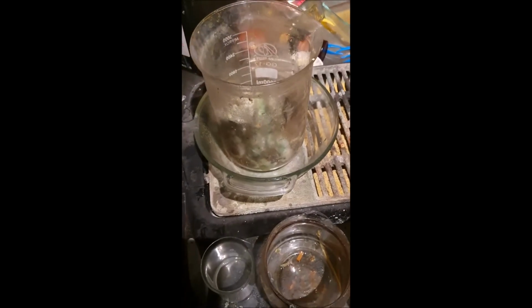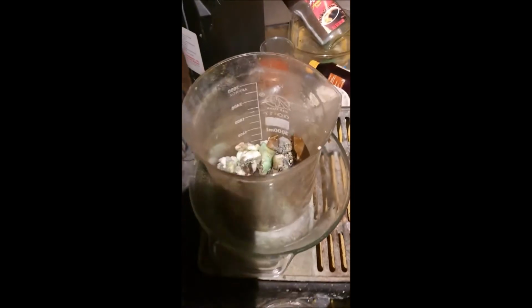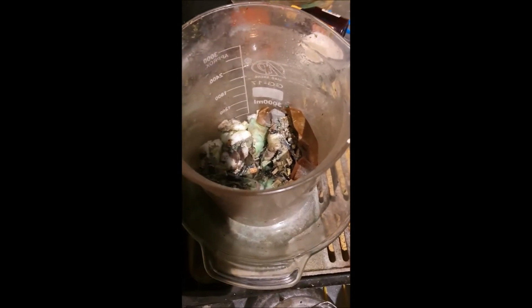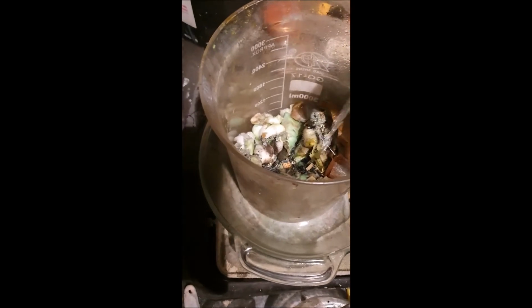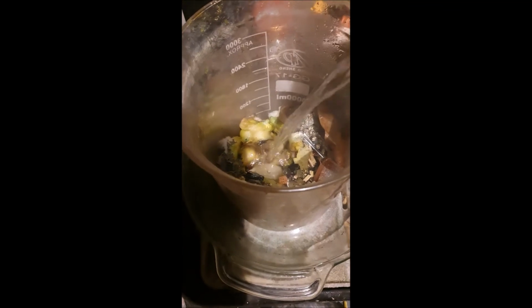Okay guys, the crystals are finished, and I've put 2 filters with foils into this beaker, as well as a whole pile of cotton balls. So I had a spill a few days ago, and I cleaned up as much as I could and sopped it up with cotton balls. So there could be anything in there. Could be gold powder, gold liquid, could be anything, I don't know. So now I'm just going to put some hydrochloric acid in here. That'll be plenty for now because it will reduce down.